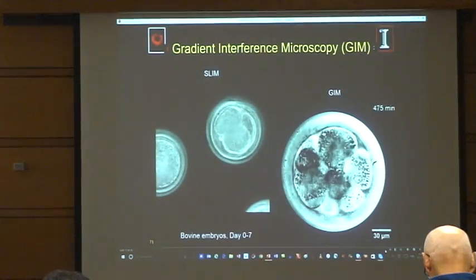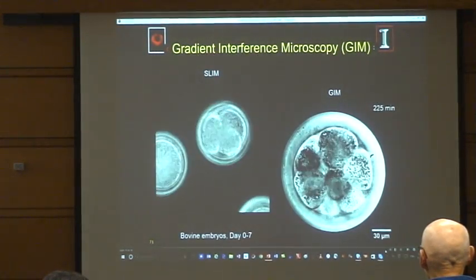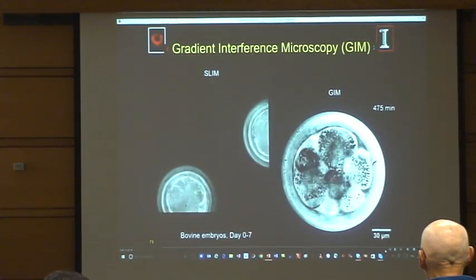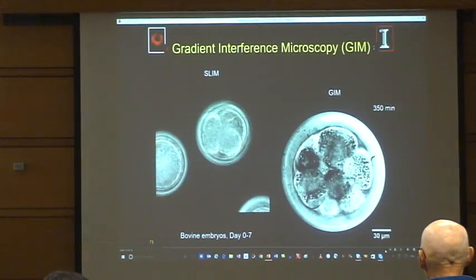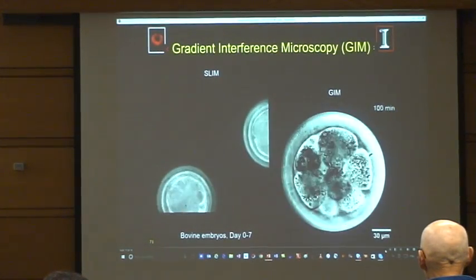So we just stuck that in. I said, I'm an optimistic person. I said, yeah, let's just put it in there, and this is what you get. Not much. You cannot see much if you just put embryos in SLIM. So you see these kind of contours of the cell. They divide. Okay, so that cell, the third cell in there, but you cannot see anything else in here.